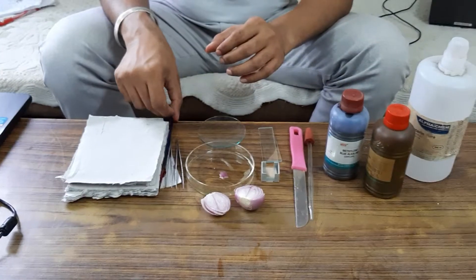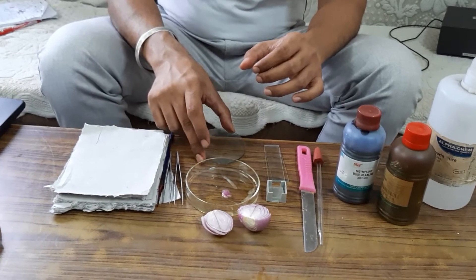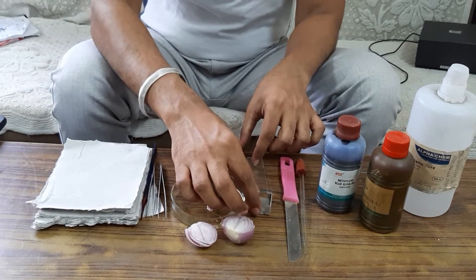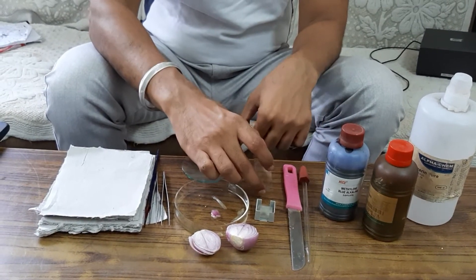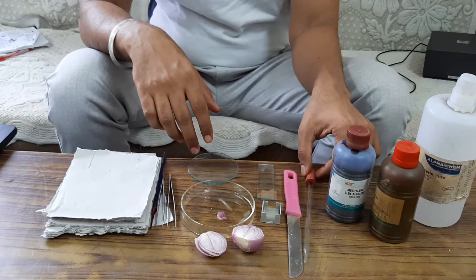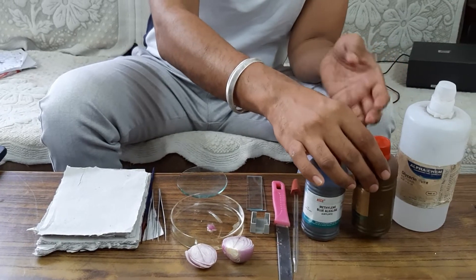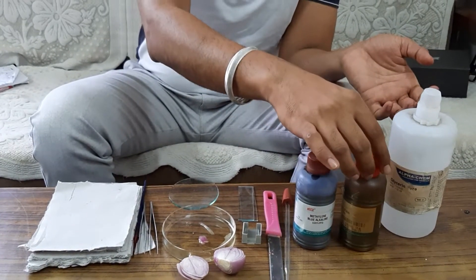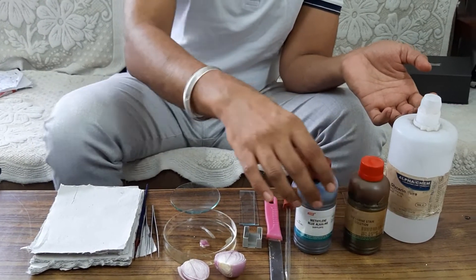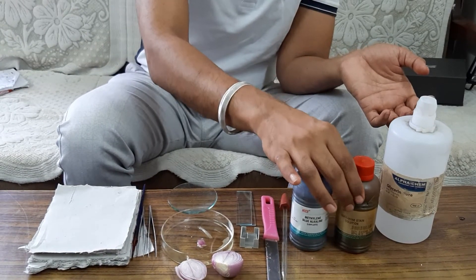I need forceps, brush, watch glass, Petri dish, cover slips, glass slide, knife, dropper, and a stain to give color to the plant cell. For staining the onion peel we usually use safranin, but you can also use methylene blue. Commonly for plant cells we use safranin.